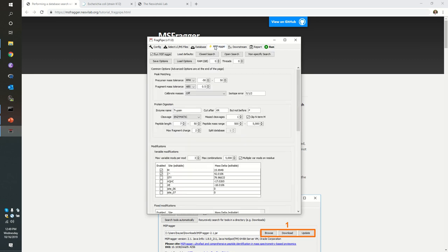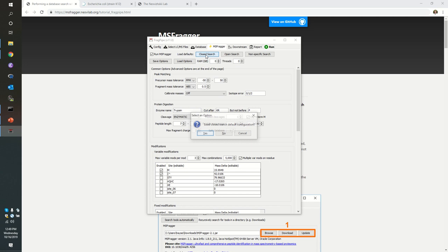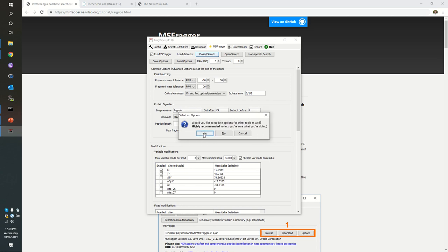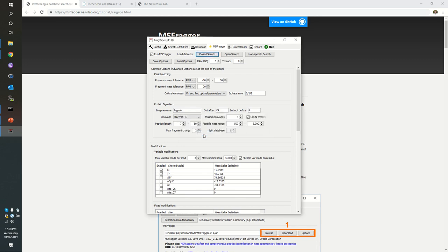We come again to msfragger. Once again, we're going to specify that we want to start with the defaults for closed search. And yes, we definitely want to set all the downstream tools to use appropriate defaults for a closed search. Again, we're not going to mess with how much RAM or how many threads are assigned.